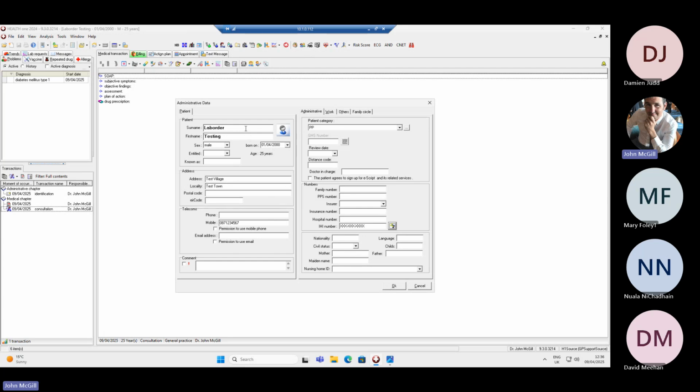One thing I would mention is a patient's name. It's best to have it in the format like we have there, just first name and surname. The system doesn't like dashes or brackets. So if you put in somebody's name and then put something like "other" after it, the system won't like that. You're as well just having the real patient's name there. So if you have any patient where you can't do a lab order, that might be a reason why.